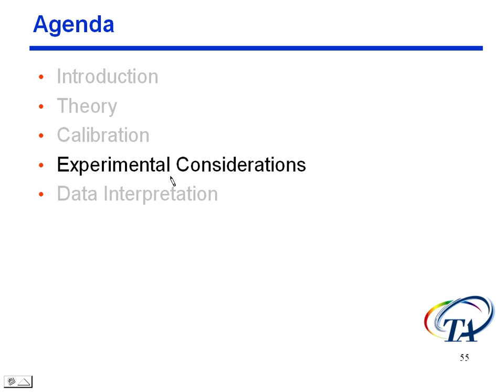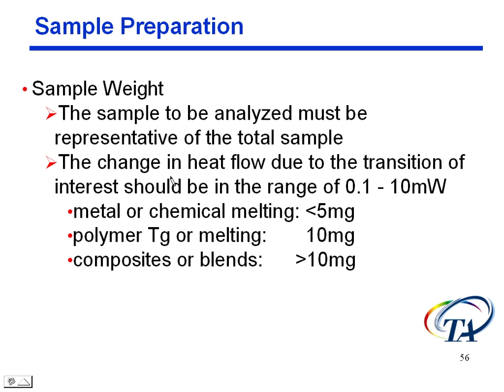So now we're done with calibration. Let's talk about experimental considerations. Just some general guidelines. Sample preparation, specifically on this slide, is sample weight.